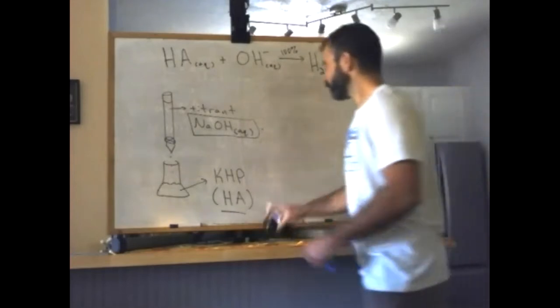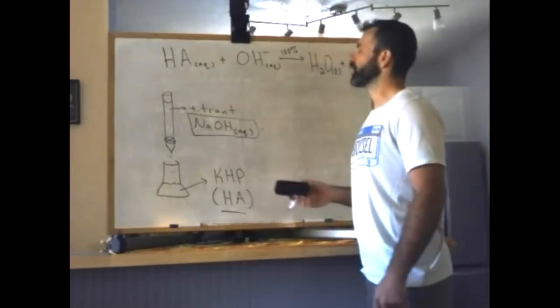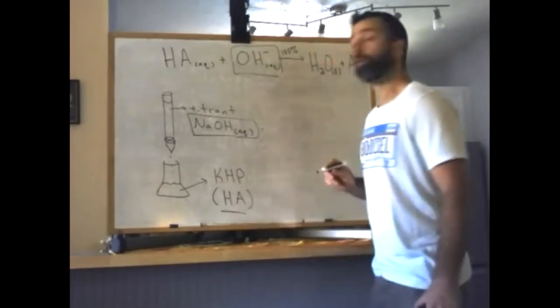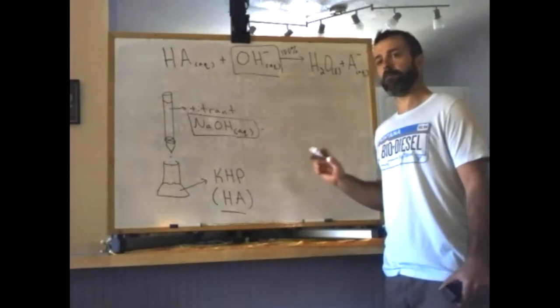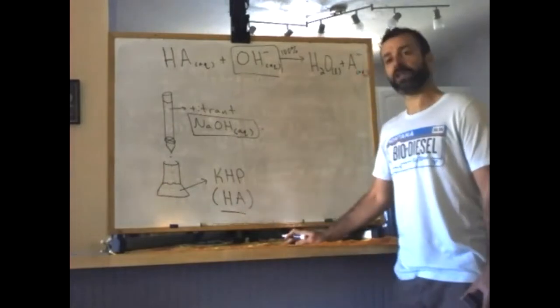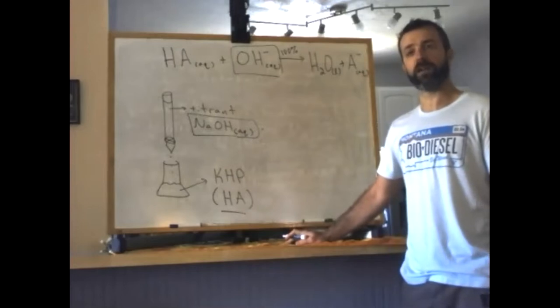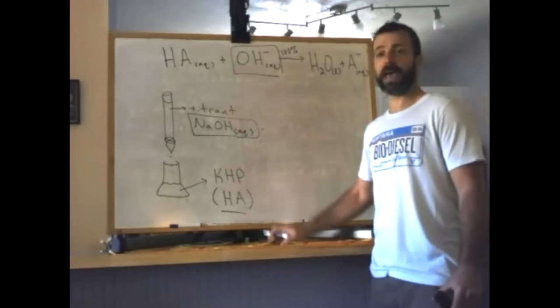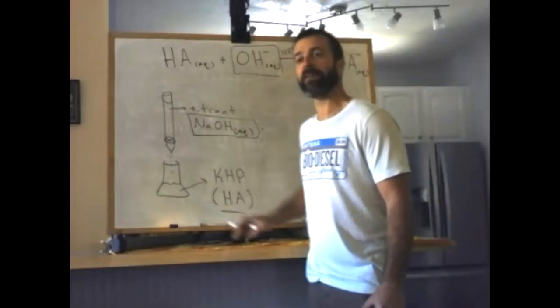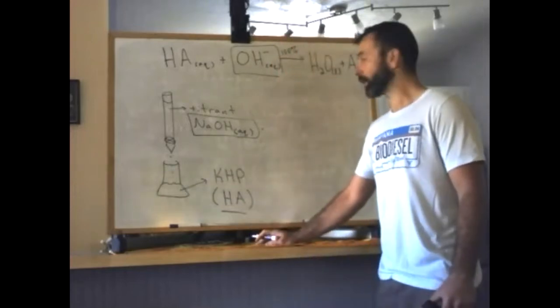All right. So how can we use a titration to determine the unknown concentration of OH minus? Well, what we're going to do is make various solutions where we accurately weigh out KHP. KHP is a solid, so we can determine an accurate mass of KHP. So we accurately know how much KHP we have down here. So that's an important step one.